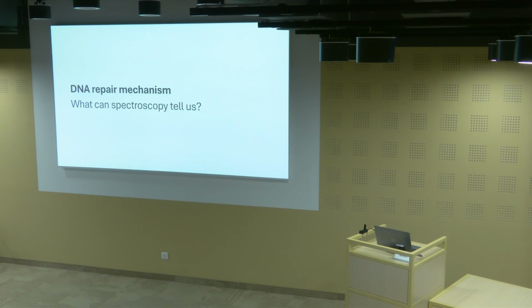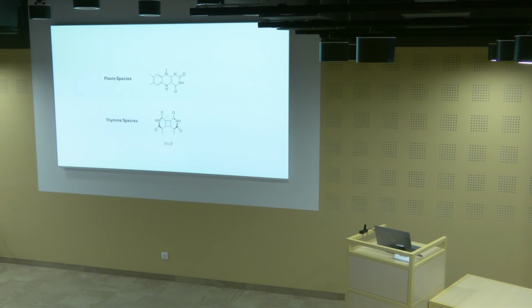When we began our work, we knew a lot about this system. It had been very well studied for a long time. There's already a Nobel Prize given in part for this, to Aziz Sancar. A lot of the previous work came from spectroscopy, but it was also backed up by computation. I'll quickly tell you what we knew when we began our work, and then try to highlight some of the open questions that we aimed to answer with time-resolved crystallography, which is where we came in. Here's the basic mechanism as it was understood when we began.